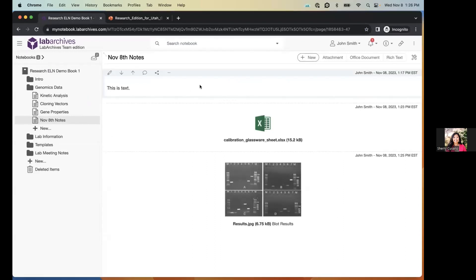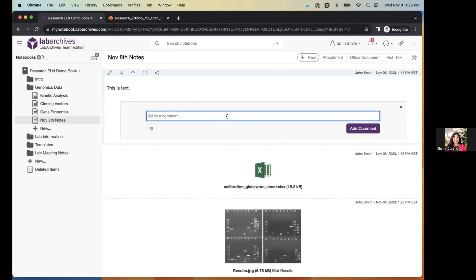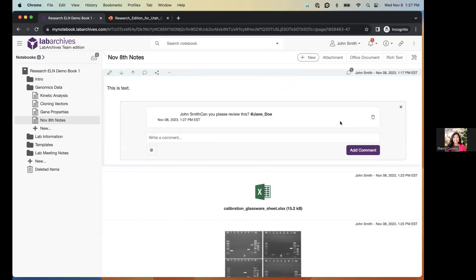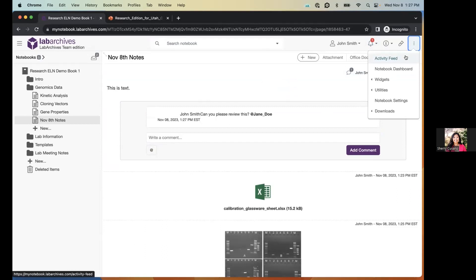Let's talk about collaboration features. If you collaborate with other researchers or undergraduate students, you can get each other's attention by commenting or mentioning someone in an entry. To add a comment, hover over the entry and click the comment button. You can type your comment and use the at symbol to mention a specific individual — for example, mentioning 'Jane Doe.' Click 'Add Comment,' and when Jane Doe logs in, they'll see a notification.